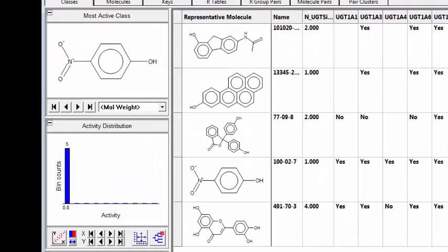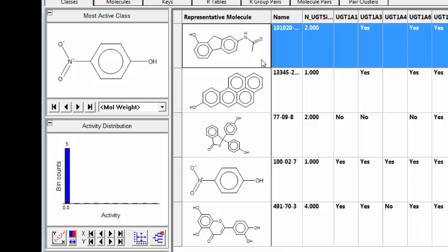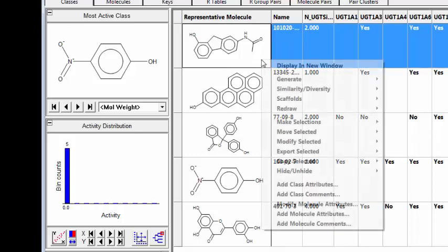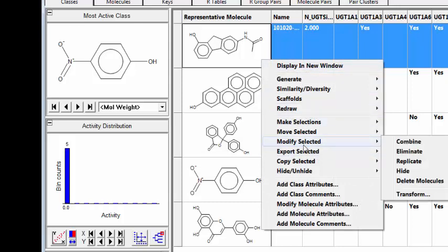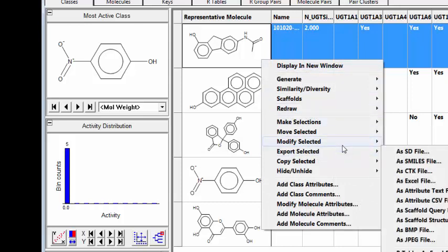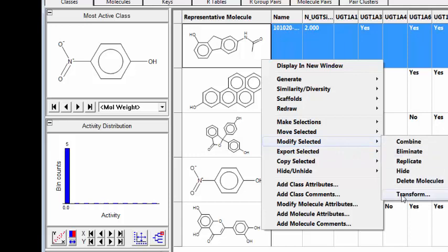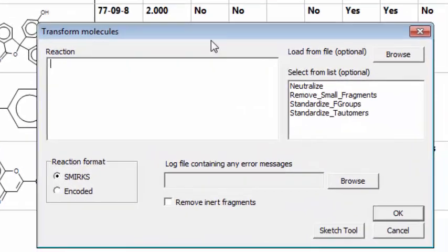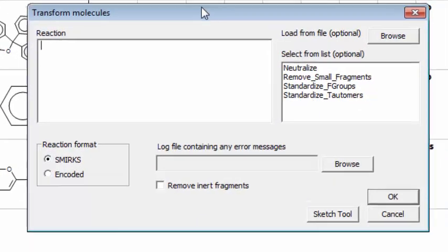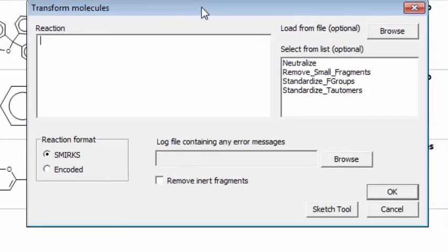I've read several phenolic containing molecules into Medchem Studio. We'll start with this top compound which was part of the slide I presented. Perform a right mouse button click and then select Modify Selected Transform. This brings up the reaction transformation dialog box.